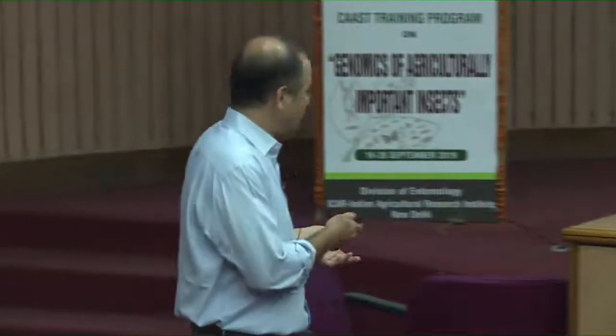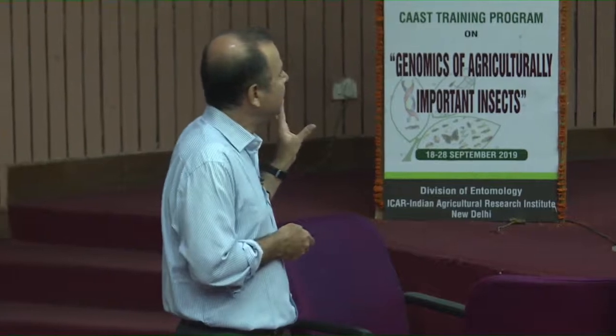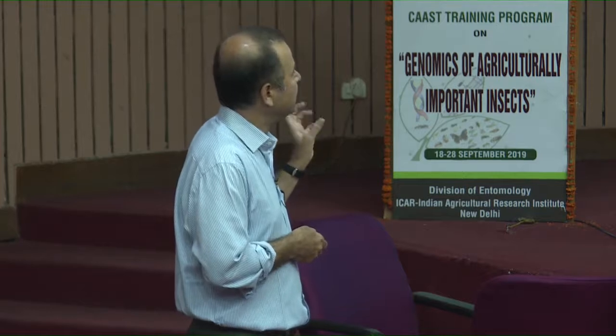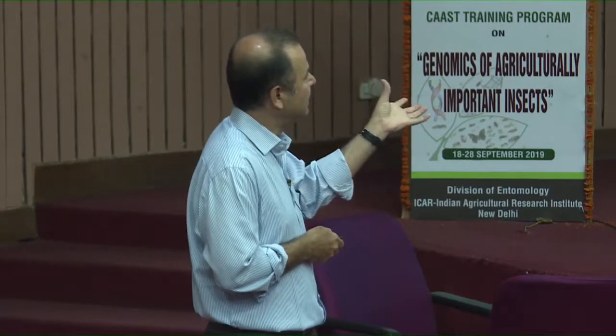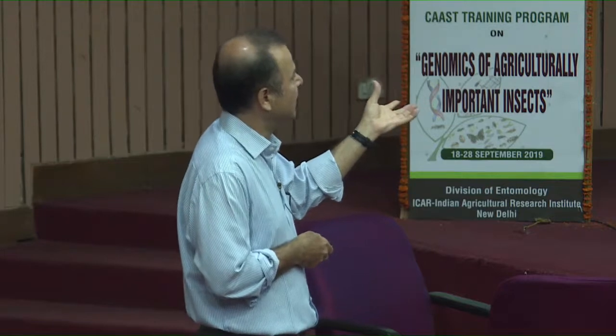Now, depending on the replicates, you have to average them; that is the reason we take replicates. So, you average them and find out the CT value of untreated, average value plus minus something, CT value of treatment A, CT value of treatment B, CT value of treatment C. Same for the housekeeping gene: CT value of untreated and then CT value under treatments.